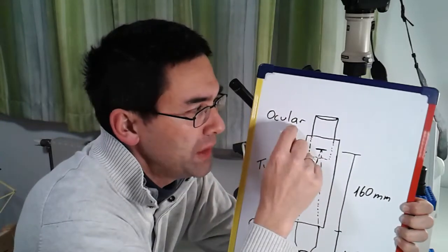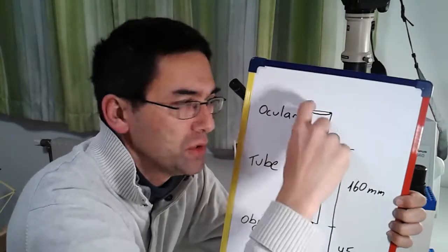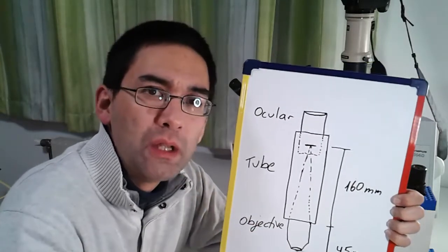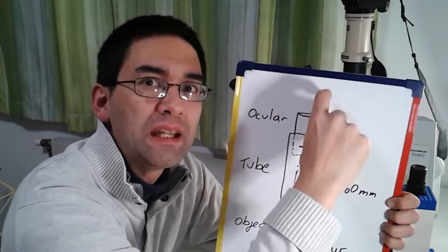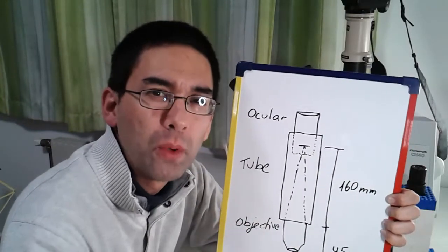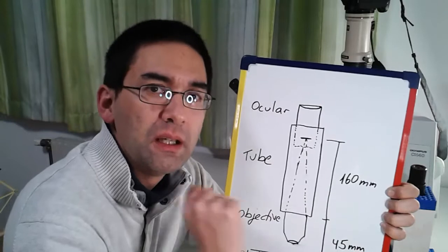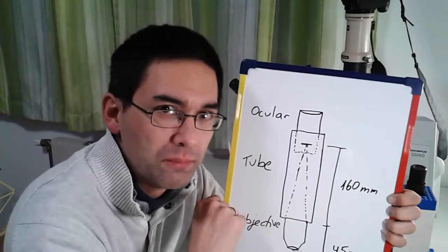The 160 on the objective refers to the 160 millimeter standard. But the 160 does not refer to the total length of the tube, but to the distance where the objective creates the image, and this image is inside the tube. At the top we have the ocular, also known as the eyepiece, and this is the part you look through. This microscope allows you to focus by moving the ocular in and out a little bit. It's not the most perfect way to focus, but it works surprisingly well. If you keep the distance of 45 millimeters constant, you simply don't have to refocus a lot at all.